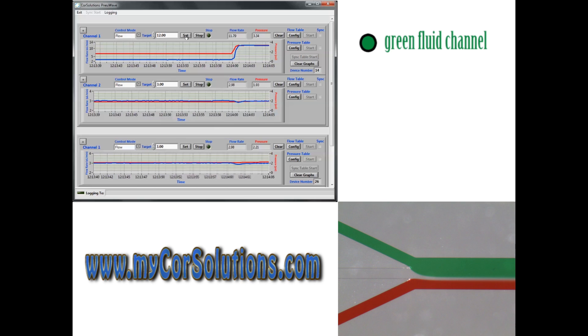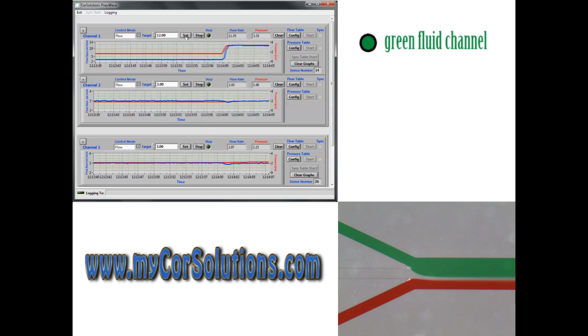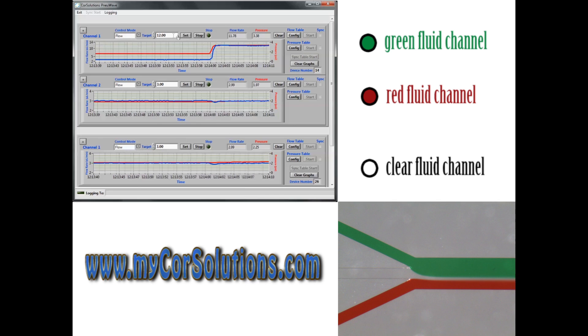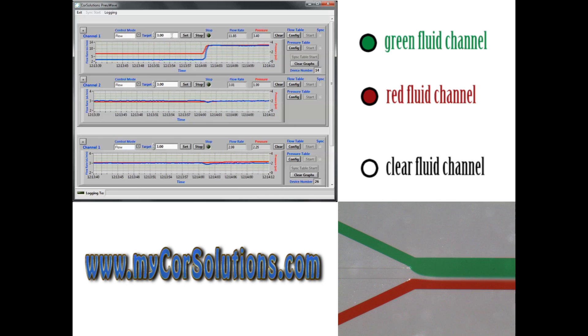Channel 1 corresponds to the green liquid on top, channel 2 is the red liquid on the bottom, and channel 3 is the clear liquid in the middle.